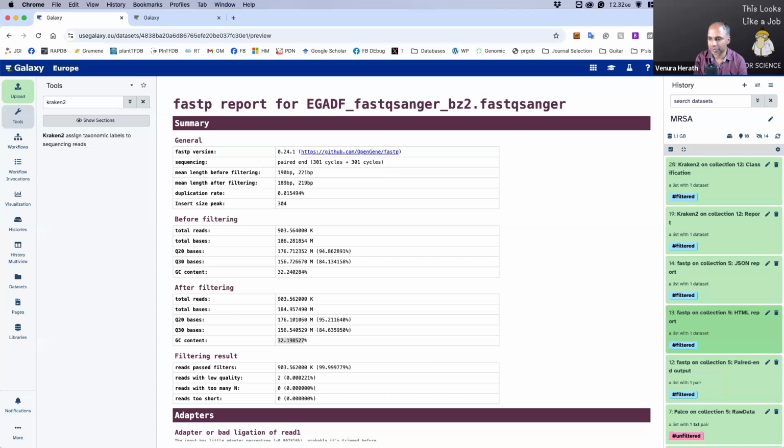You should get two files, the classification file and the report file. We are going to start with the classification file. So go ahead, those who got results, check the classification file and see whether you can interpret what is given there.